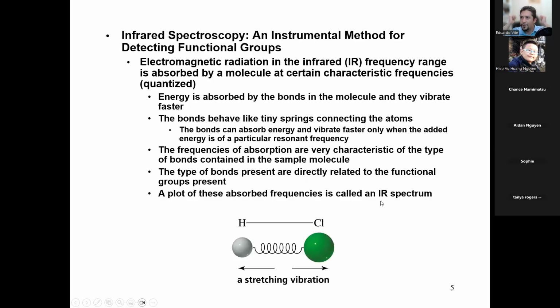Alrighty, so we get to infrared spectroscopy. So I showed you the instrument, I showed you how it looks. The energy gets absorbed, so you could think of it like a spring, right? I have a spiral notebook right here. You could think of this whole spring as a bond. And then at one end, I have one atom, and at the other end, I have another atom. And you can vibrate the spiral notebook and you can compress it and you can stretch it. Imagine bonds like a spring, right? In physics, we call it the harmonic oscillator. That just means a spring. We like to be fancy.